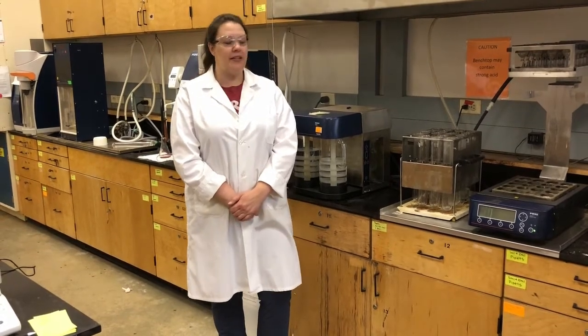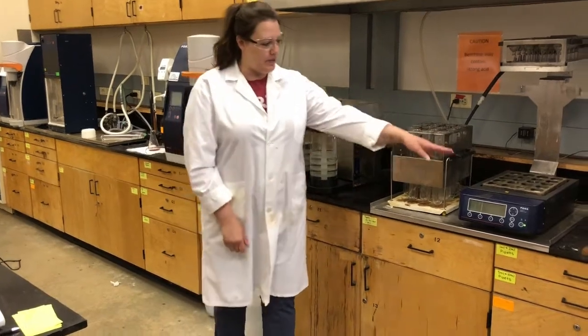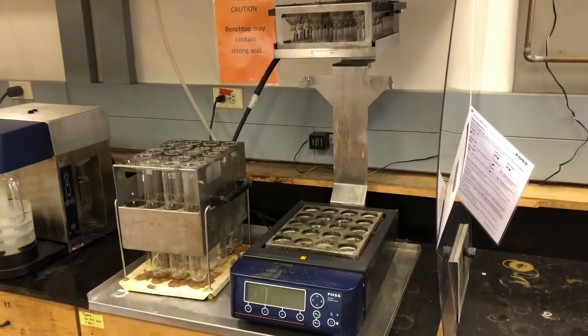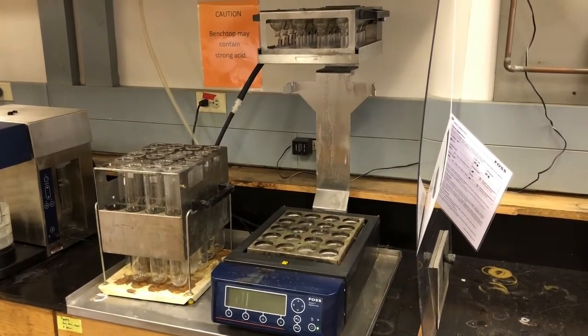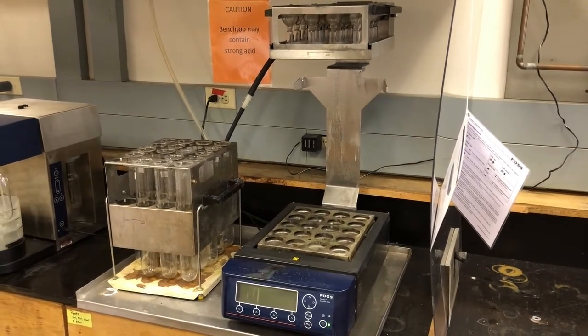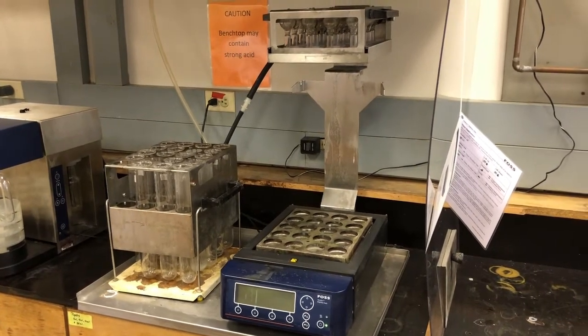So it's a three-step process that we're going to go through. It starts with the digestion. So right here we have a digestion block, and this heats up the sample to a really high temperature and digests the sample with sulfuric acid and a catalyst to break down the organic nitrogen into ammonia, and the ammonia reacts with the sulfuric acid and produces ammonium sulfate.